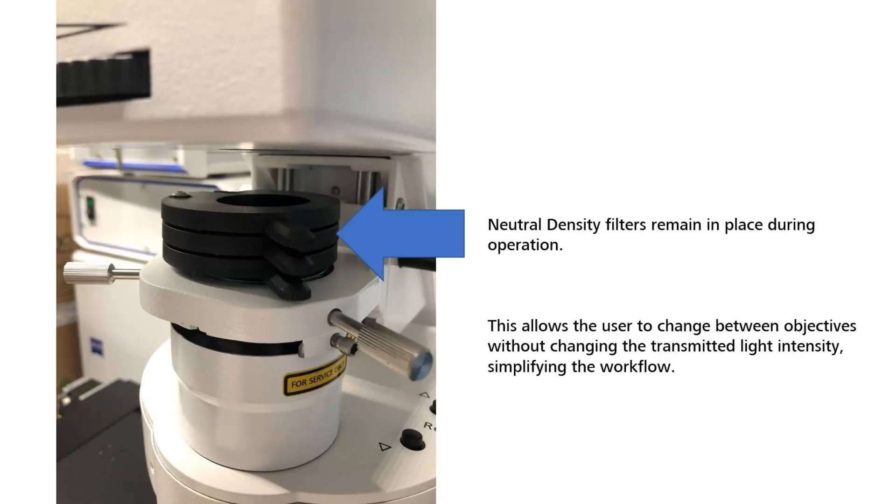With the hardware powered on, find the RoboSoftware icon on the desktop of the acquisition PC and start the software. The hardware will initialize during which time the motorized stage will move to the extreme upper left and then return to the center position.